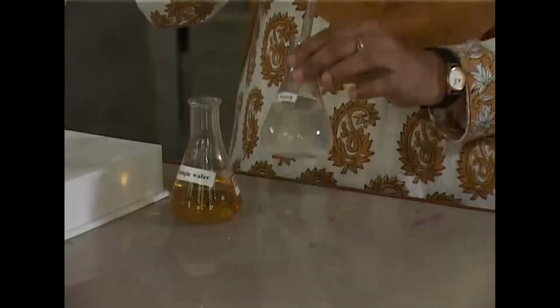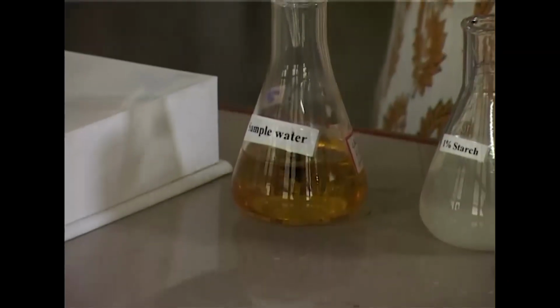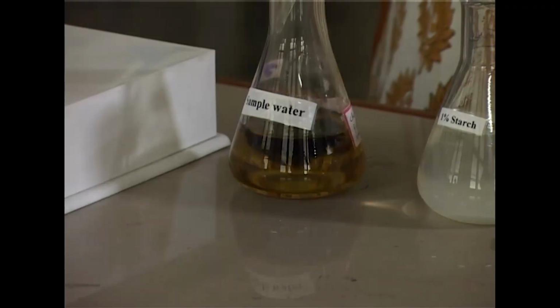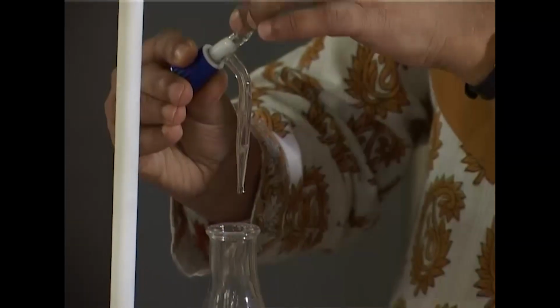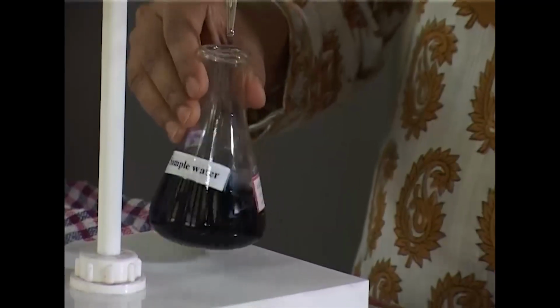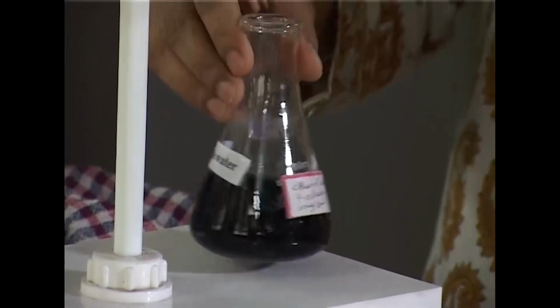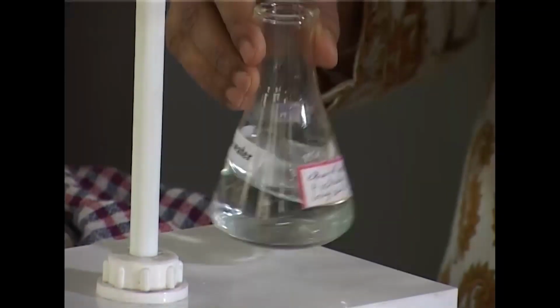Now after the appearance of the pale yellow color, we add about 1 ml of the starch solution. And immediately after the addition of the starch solution, we find that a blue-black color is formed and the titration is continued till this blue-black color, here you can see in this flask, changes to a transparent color. That means this is the end point, when the blue-black color totally disappears and becomes colorless. So this is the amount of the titrant, that is the sodium thiosulfate, required to bring this reaction to the end point.